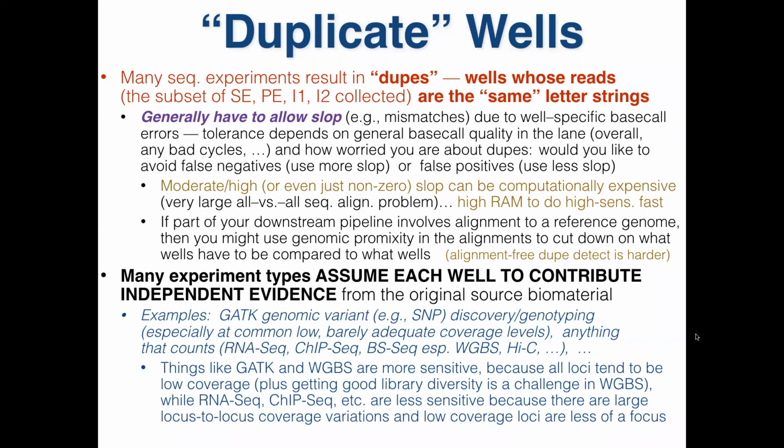And sort of, if you can, just finding the pairs of sequences, or, it's more than just pairs. When we say duplicate, these two wells may have the exact same sequence. Well, let's just go to the exact same. This well and this well now have, let's say we're in pair A, so we've got 4 reads. So this guy and this guy have the same exact sequence of the read. That doesn't mean that's the only 2 copies. There could be another well over here that's the same as these 2 wells. So when we talk about duplicates, we usually consider them in groups, right? Which is all the copies that you consider sequence similar enough to be the same, right? So a group, some guy may have 1327 duplicates or something, right?